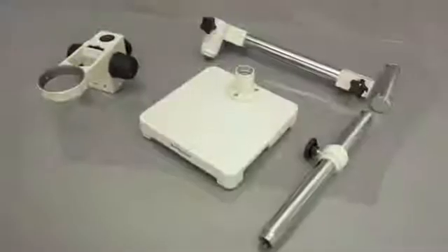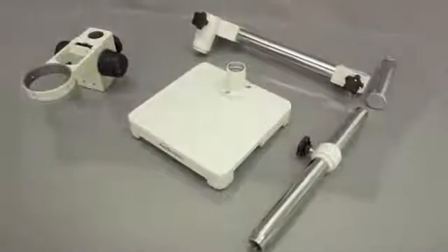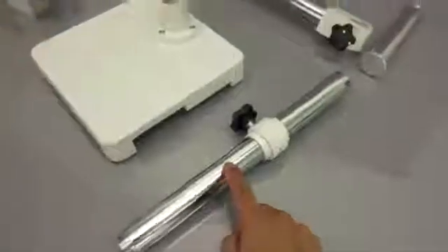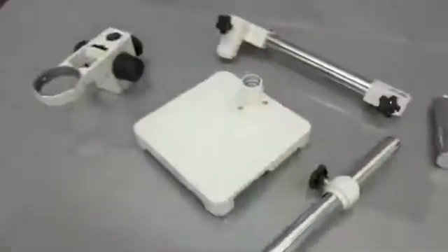Alright guys, this video is going to show you how to attach the SAW, which is the single arm boom stand. There's a number of different parts. First you have the focusing rack. That's where the head of the microscope is placed. And then you're going to have the stand. This is the pole that goes into the stand right there. And this is going to be the arm that holds the focusing rack. And this would be placed into here. So let's go ahead and get this thing assembled.